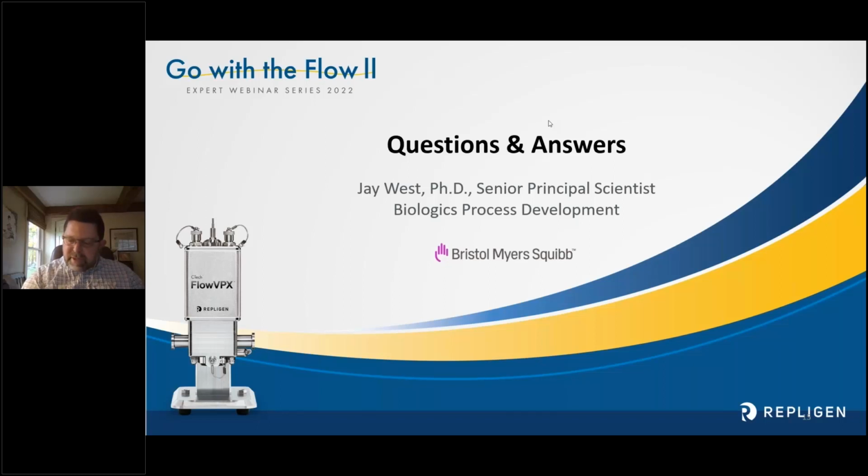Yeah, so validation is kind of a big deal, and there's a lot to a validation, so I'll just say that the one thing you cannot deviate from, I think, is the 5% comparability. It needs to be within 5% of the offline method, and that's a critical part of the validation.